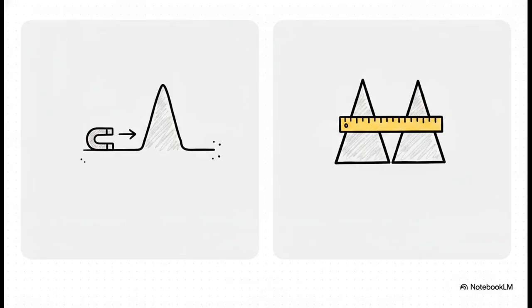And there is a really hard line here between our two main metrics, chemical shift and the coupling constant. Chemical shift, which dictates where a peak drops on the x-axis, totally changes depending on the magnetic field strength of your machine. If your lab buys a bigger, badder spectrometer, that chemical shift measured in hertz gets larger. But the coupling constant? No way. It's a physical truth. Whether you're running a 60 megahertz machine or a 100 megahertz machine, the J value for ethyl iodide stubbornly stays at exactly 7.5 hertz. The spacing between the lines of that multiplet simply does not expand.